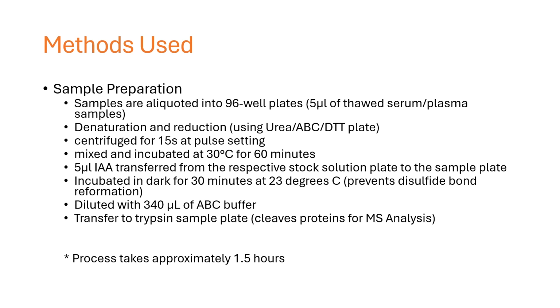5 microliters of iodoacetamide is then added, and what that is doing is making sure that those bonds that you've broken apart do not reform. They're incubated in the dark because it is a light sensitive process. They're incubated in the dark for 30 minutes at 23 degrees Celsius, and then they're diluted with a buffer.